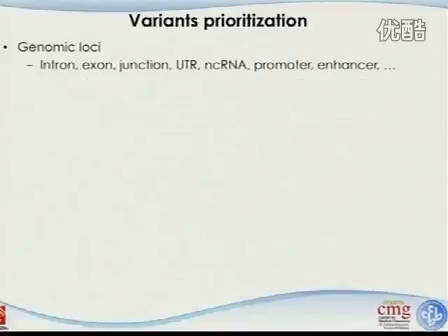So for variant prioritization, for exon sequencing, we will identify anywhere from 20,000 to 40,000 variants. And how do we further do the prioritization? Of course, if we have the luxury of family information, that is a really helpful filter for us. But for a lot of studies, that information is not available as well. So doing the variant prioritization is really important.